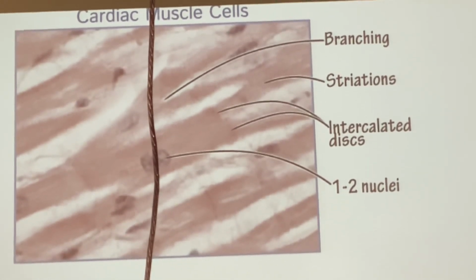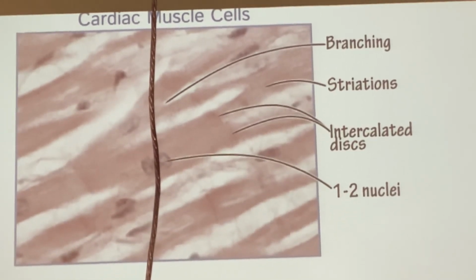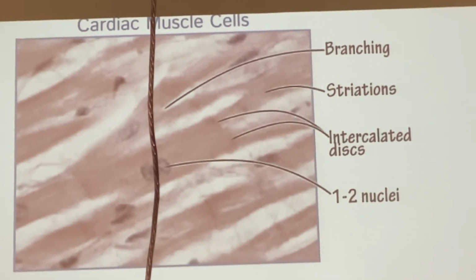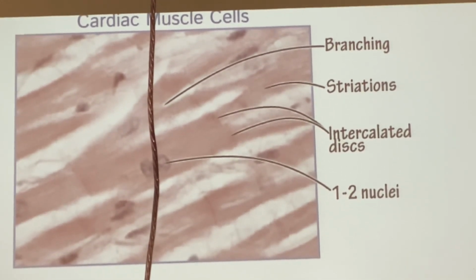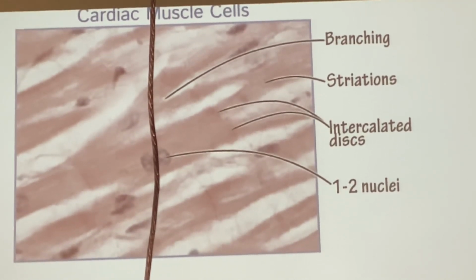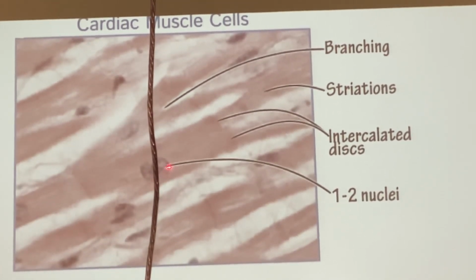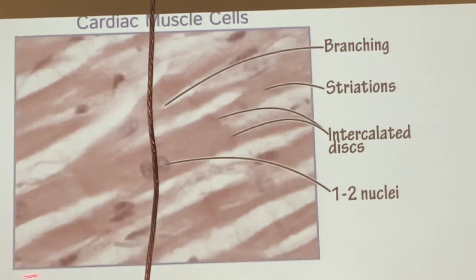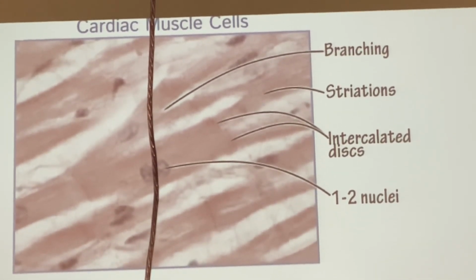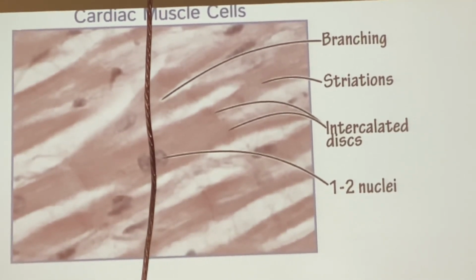Normally it has a single, centrally located nucleus, but sometimes, which is rare, we have binucleated cells, with one or two nuclei in the center of the cell. And the white areas are loose connective tissue, which contains the vasculature for the heart muscle. Okay?